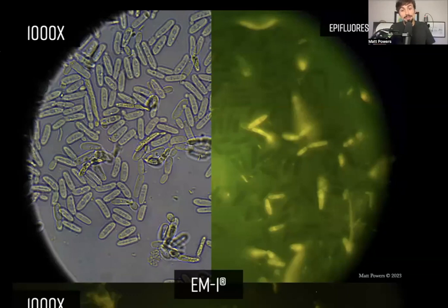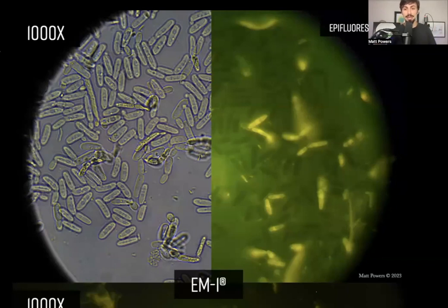What's cool about this image — think about the epifluorescence lamp on the right side, where it shows that some of these are glowing and some are not. When you test them, you'll find that there's no nitrogen and no phosphorus.